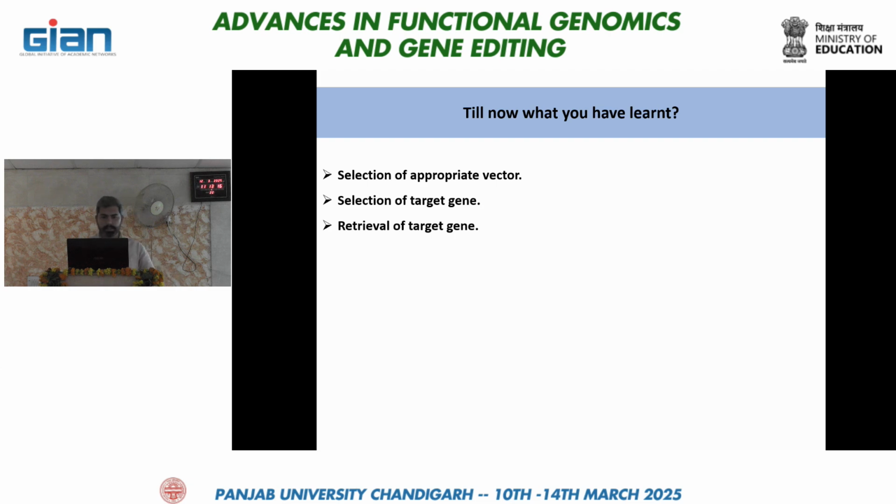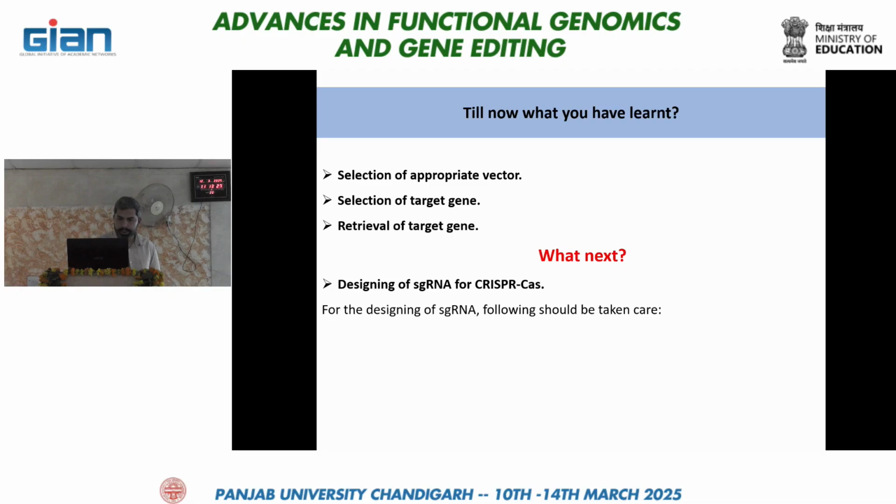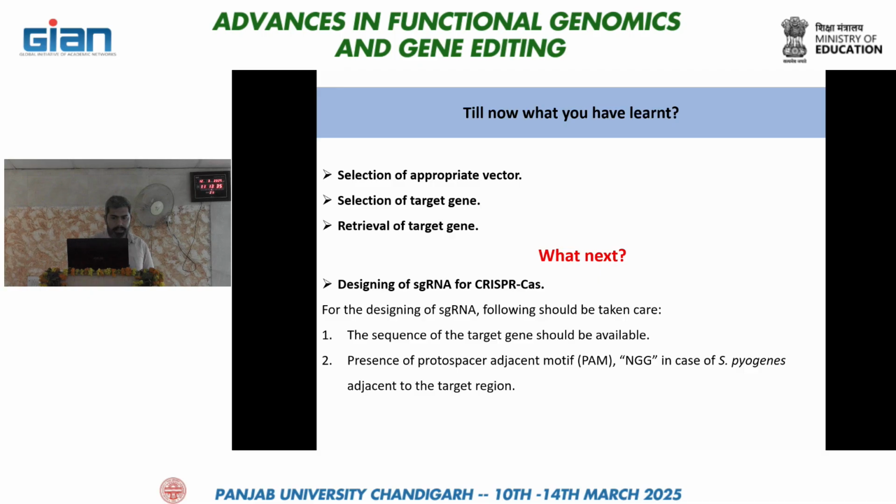So we have covered this part, and what's next? The next is designing our single guide RNA, for which, like I have mentioned earlier, the sequence of the gene should be available or known to you. And second is the presence of PAM, protospacer adjacent motif. In our case, we are talking about Streptococcus pyogenes, so the PAM is NGG, and depending on the variant of Cas you are using and the species from which it has been derived, the PAM changes.